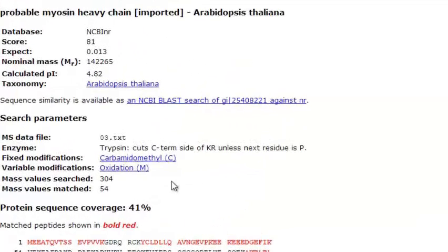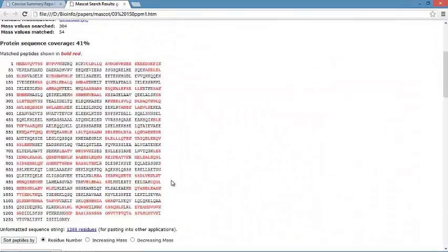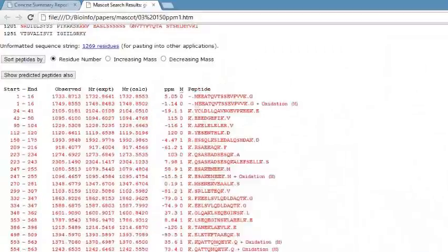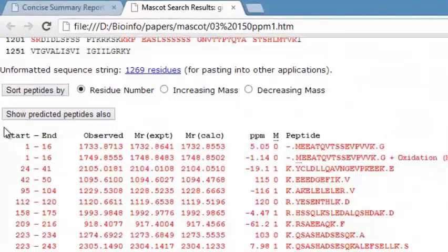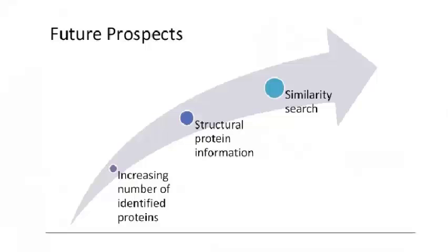It also gives detailed information including the protein name, sequence coverage, and matched peptides shown in red. We can also get the peptide information. The future prospects include increasing the number of identified proteins, finding structural protein information, and performing similarity search.